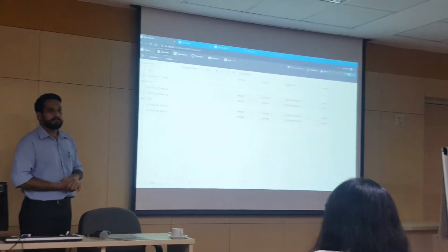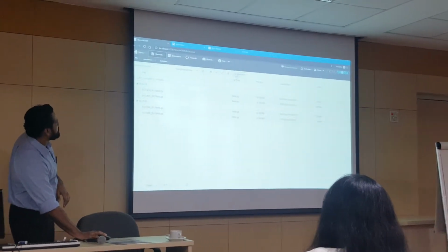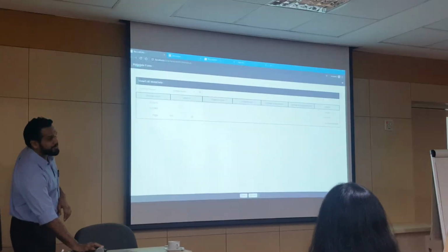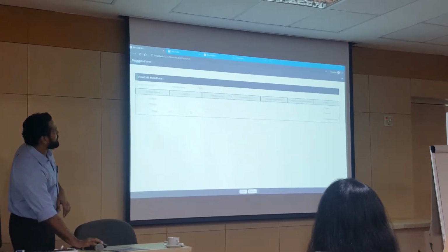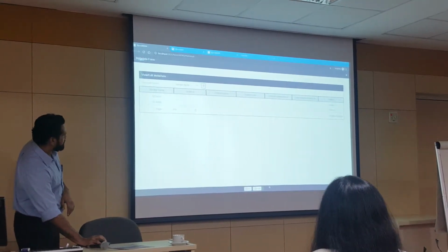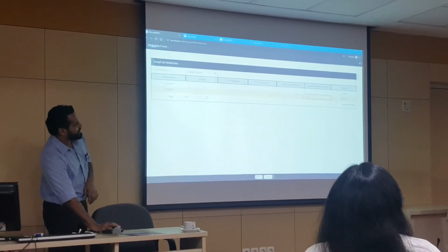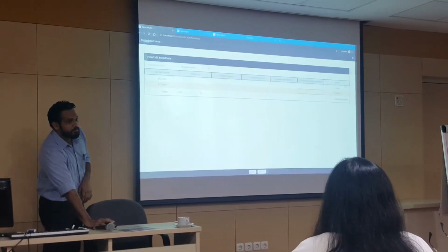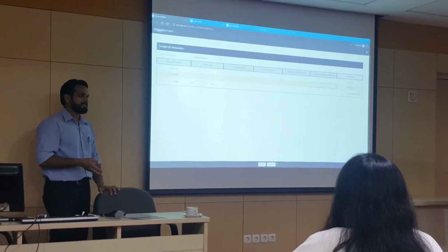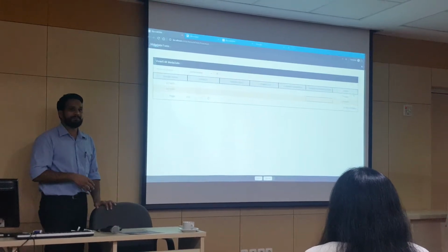And within the data hub, you can actually add your metadata to your files. So these are some of the prefix metadata, but you are also able to add your own metadata if you would like to. So if you add a new column, you can actually add new metadata. The resolution is not good. There's a new column, you create a new column here. You can add your own metadata. And this metadata you can actually use for downstream analytics. So if you're going to group your samples, your data, your outputs, you can do it by the metadata itself.